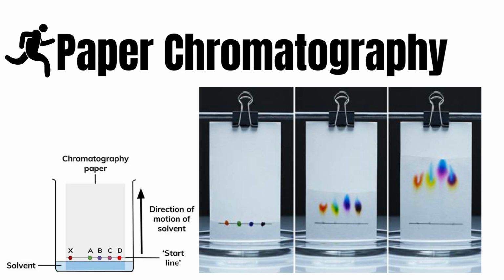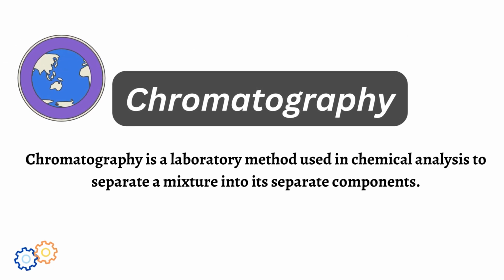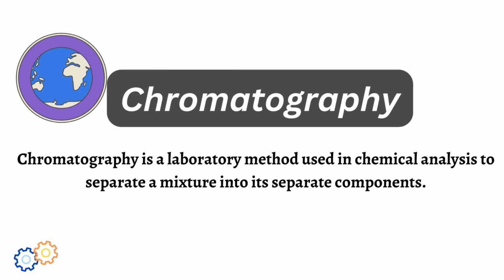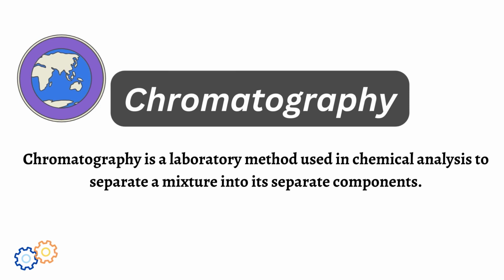Let's get into today's video on paper chromatography. The foundation of chromatography is the idea that mixtures of molecules applied to surfaces or solids and fluid stationary phases, stable phases, separate from one another while moving with the help of a mobile phase.